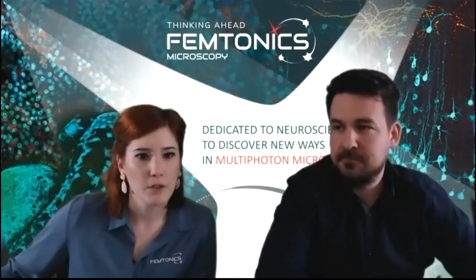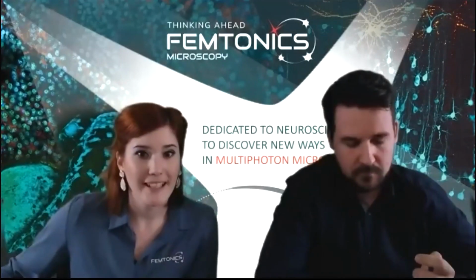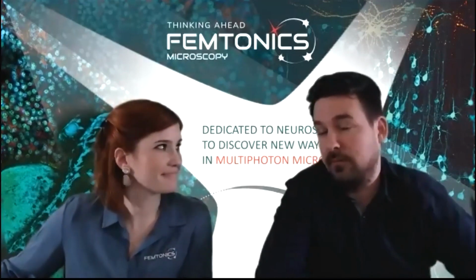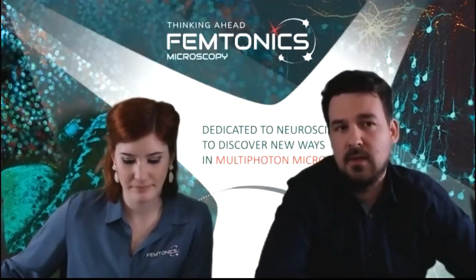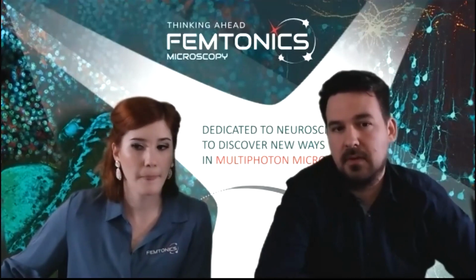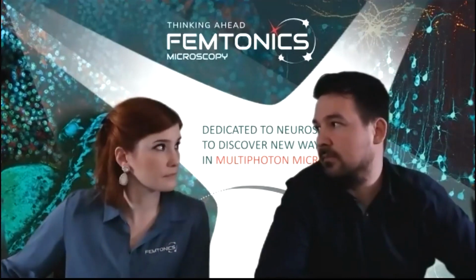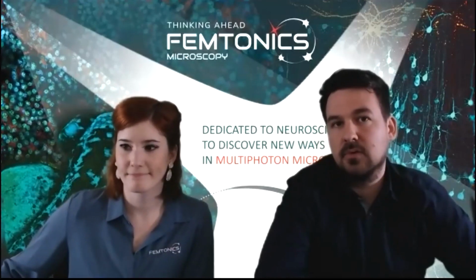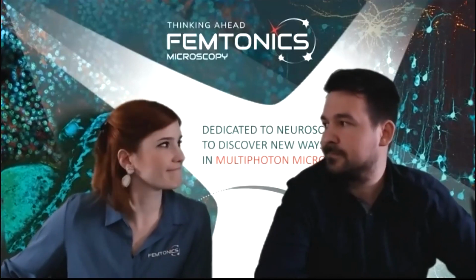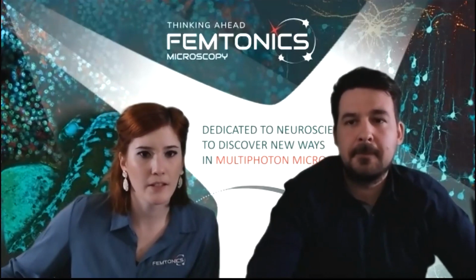Okay, next question. I have my own MATLAB scripts. Can I use them to control the microscope? Yeah, of course. Yes, the answer is yes. If you have some nice scripts for analysis or something, then you can easily run your MATLAB code after the measurement, or you can even control the microscope from the command window. Yes. Thank you. Next one.